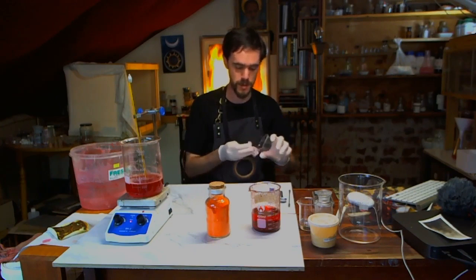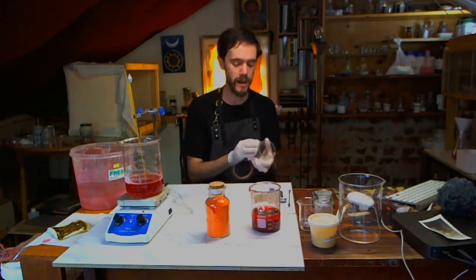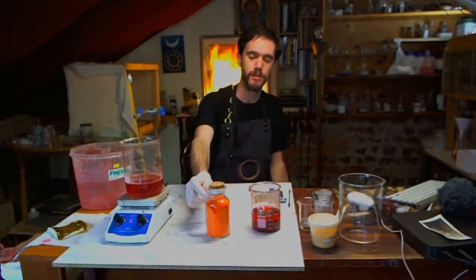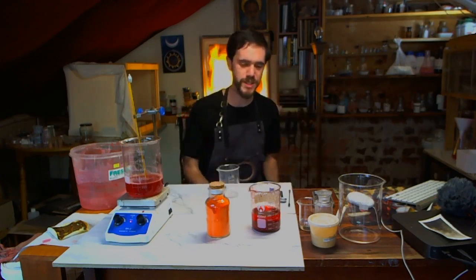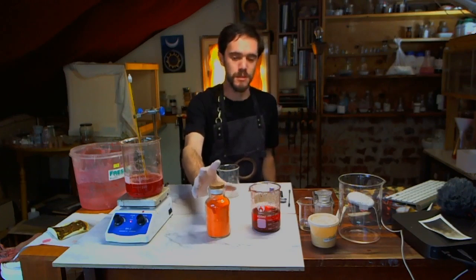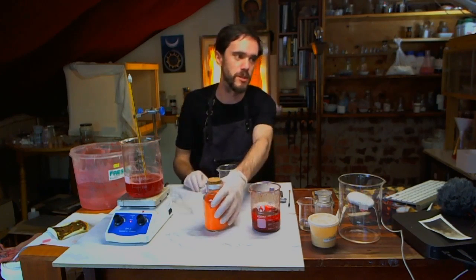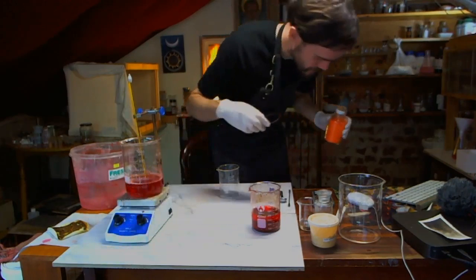So gloves, be careful. And also be careful with rinsing it out and washing it out after you've finished using it, because hexavalent chromium is very damaging to aquatic water systems. So if you're going to use it and you have a waste product of any of this sort, neutralize it with sodium carbonate or something like that, just to turn the chromium into more of a chromium oxide so that it's not soluble when you go washing it down. The way of collecting waste, that's good too. Alright, that's hot enough now too.